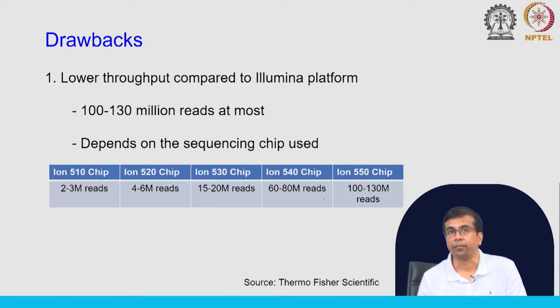It also varies with the sequencing chip that you use. You can see some of the chip names and the throughput that you will get from these chips. Depending on your application, you will pick the right one, which will be most suitable.